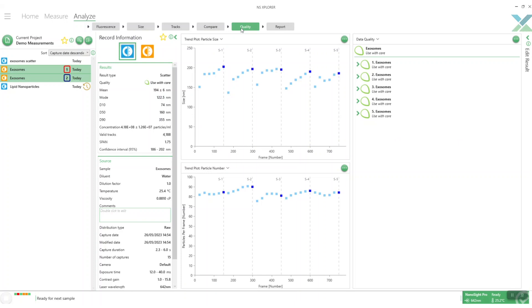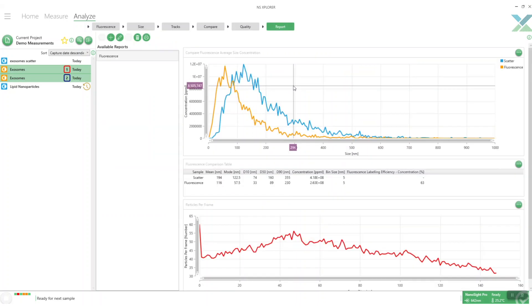We've also got our quality page so here we can look at things like our data quality guidance giving us an idea of if we've got any possible issues with the measurement if there's anything we can do to improve them. Finally we've got our report page where we can customize a report and use it to print it off as a PDF.